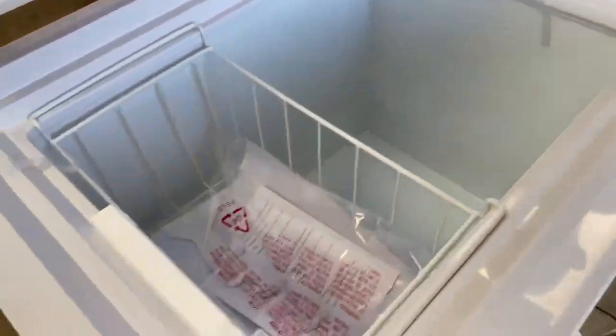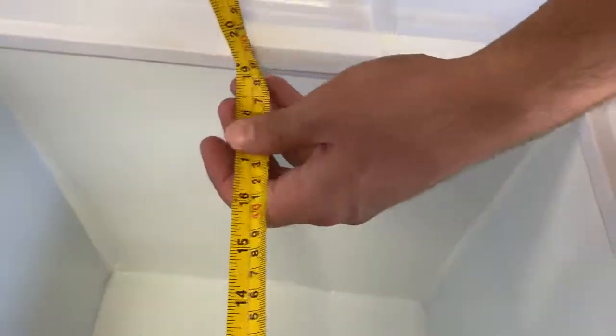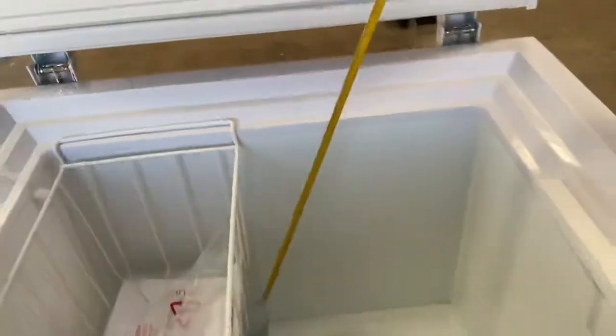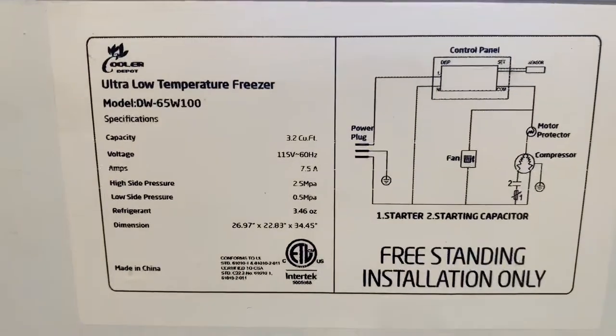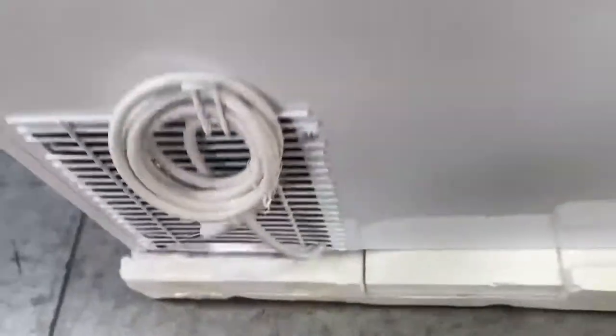Now we're going to go ahead and show you the inside. As you can see, you will be provided with a basket. Inside measurements, you're looking at 20 inches by 14 and a half by 25. You can also locate specs on the back of this freezer unit — it's going to be certified, and there's a 110 volt standard US plug located on the back of this freezer.